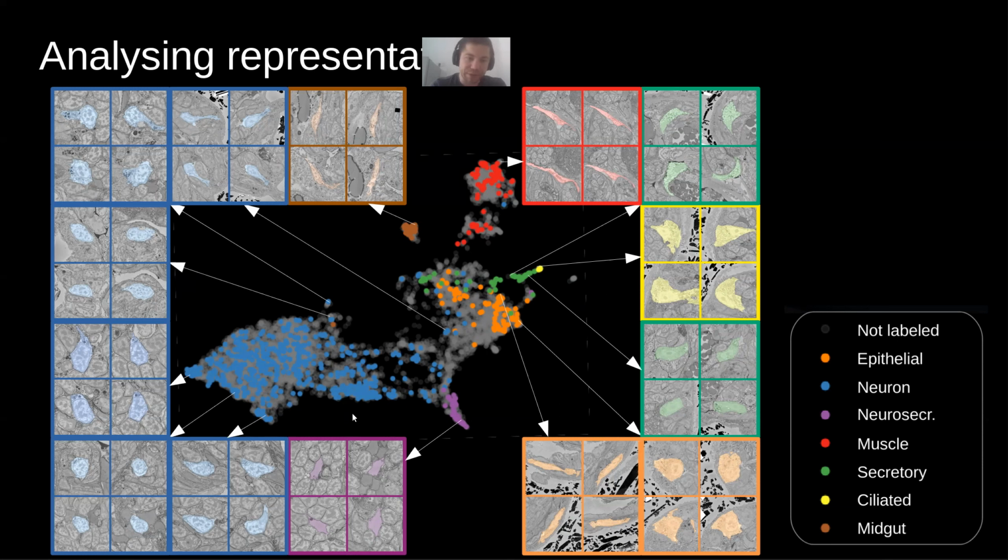And what we then checked essentially is we sampled a cell in this morpho space and checked its 3 closest neighbors. So for example, if you take a look at the 4 cells in the upper left part of the figure, you see here the cell that we originally sampled, and those are the 3 closest neighbors in feature space, and they're indeed morphologically very similar in terms of shape and texture. And when you compare them, for example, with a cell belonging to a different class, for example, muscles, clearly different and they are far apart.